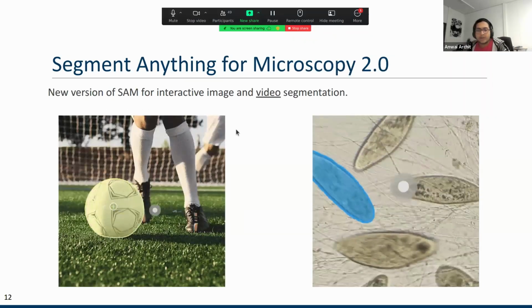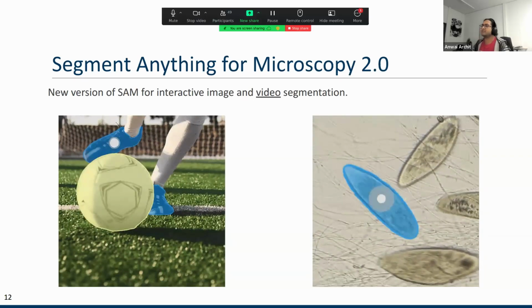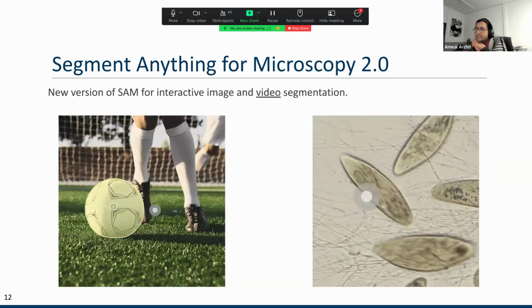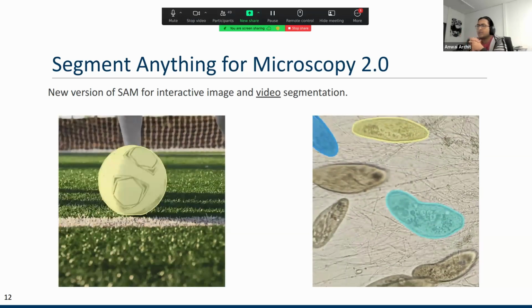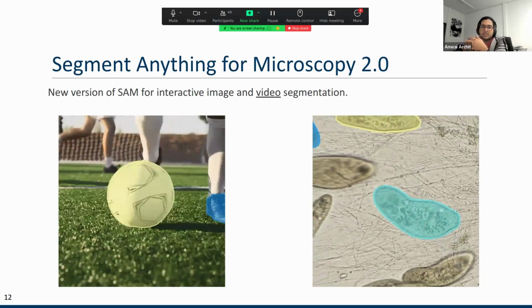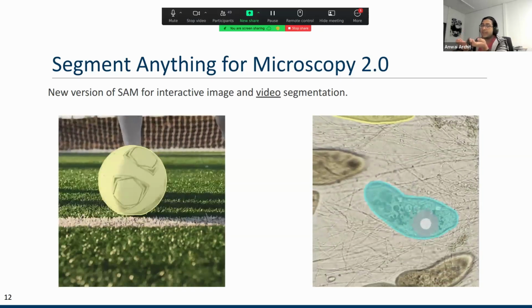Now, a quick teaser, like we've been talking about this in a few conferences here and there, but a quick teaser for everyone. We are working on Microsam 2 right now. And this is directly inspired by the new version of Segment Anything model, which has been out for a year now, actually. Wow. And the model can universally do image and video segmentation. So with the click and box logic, as we discussed, they can do exactly the same for videos as well now.